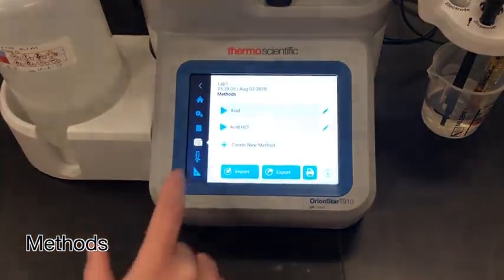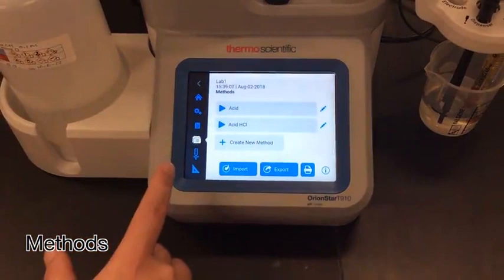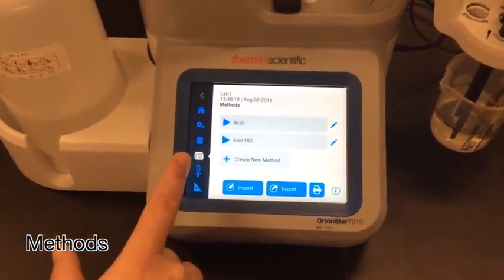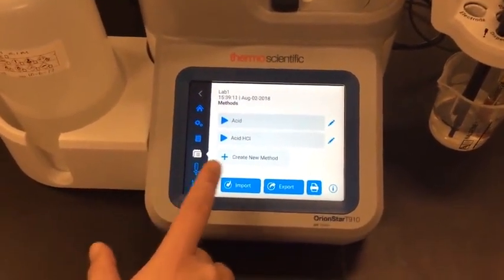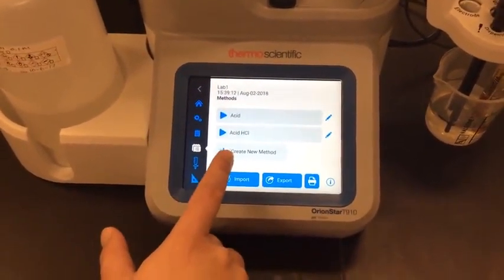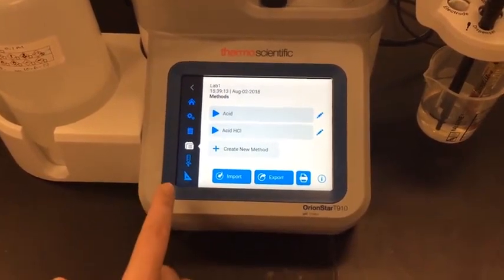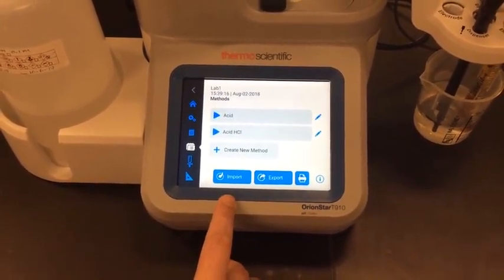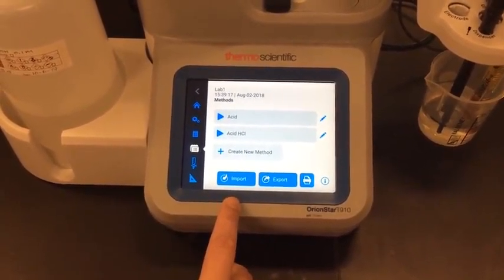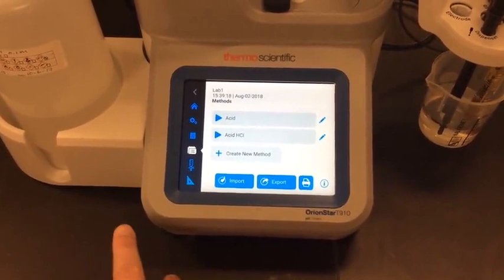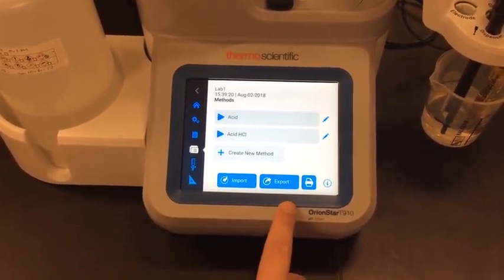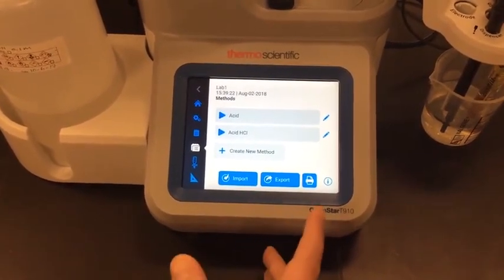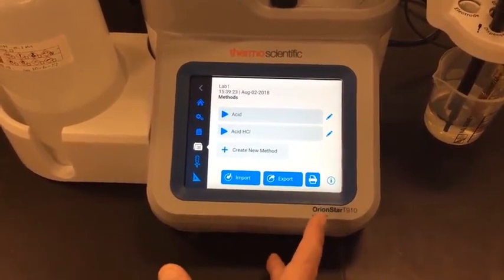The next screen I'm going to go into is my methods screen. From here I can see that I already have two methods saved, and I can create a new one — I can do up to ten. I can also import methods from a USB flash drive if I've already created them, or export them to a USB flash drive in case I want to load them onto another titrator.